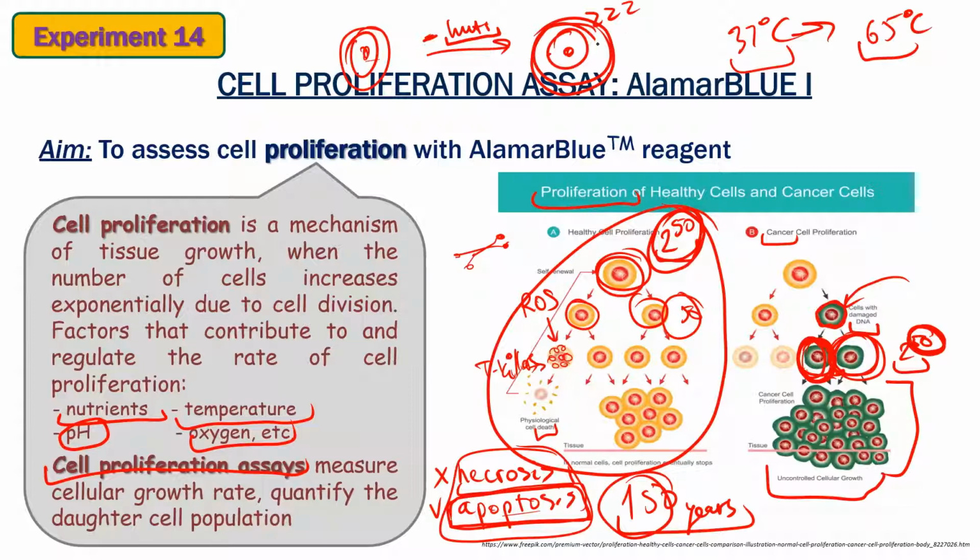So you know that we freeze them, and the frozen cell can be held in the freezer for years. And you know that if you want to transport the embryos, for example, you could do that while they are in liquid nitrogen. This liquid nitrogen has the minus 196 Celsius degree temperature, and by gradual freezing of the cells, we could keep the embryos, and as you can understand, embryos are a developed organism.